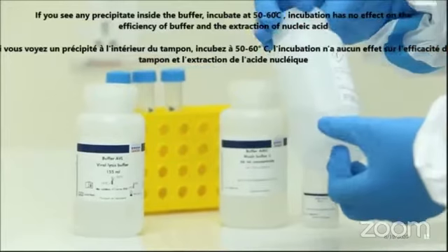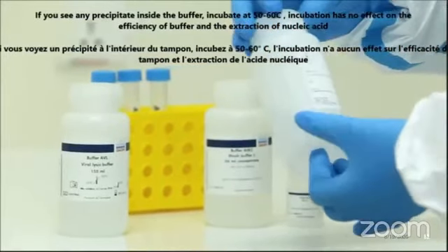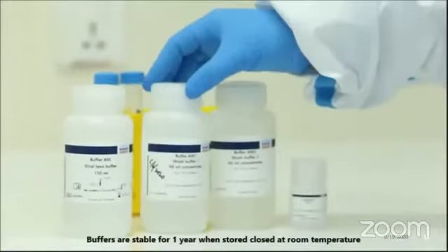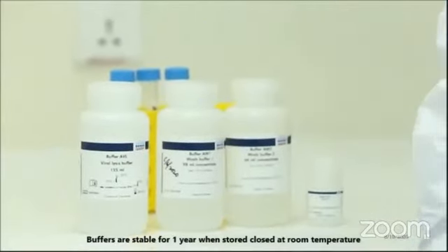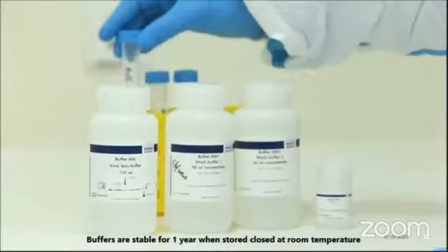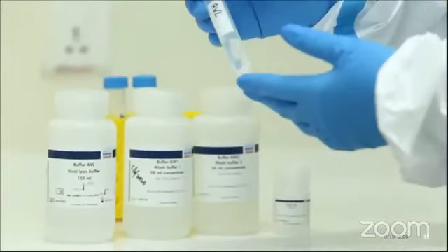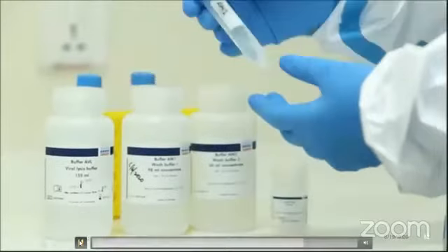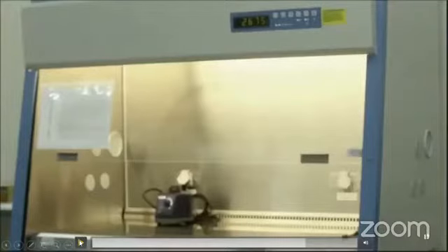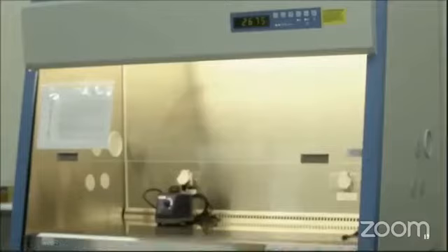If you see any type of precipitation inside the buffer bottle, incubate it at 50 to 60 degrees centigrade. This incubation has no effect on the efficiency of the buffer. Do not heat the buffer after addition of the ethanol. It is advisable to aliquot the buffers to avoid any inconvenience.